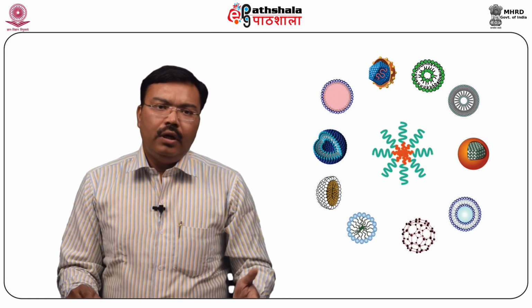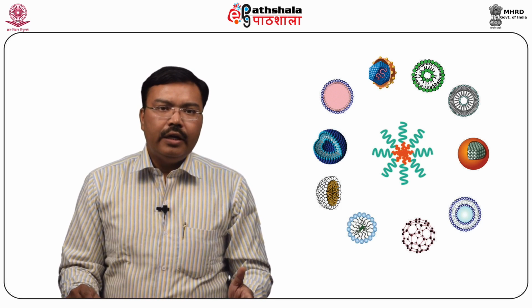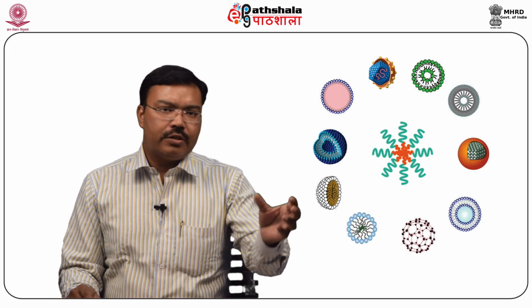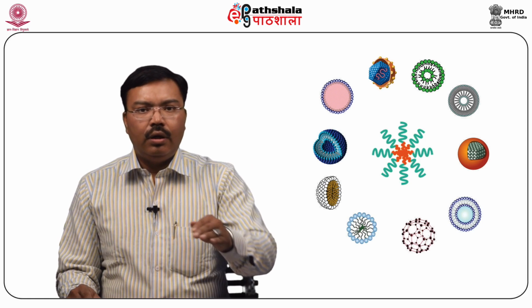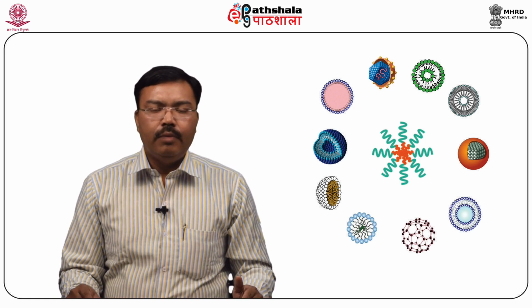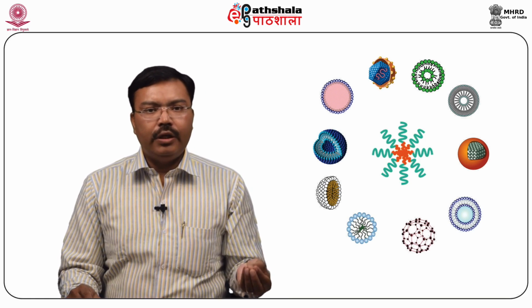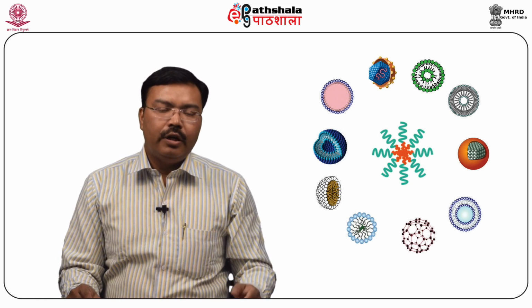In principle, phase contrast microscopy is an optical mechanism to translate minute changes in phase into respective changes in amplitude, which can be visualized as differences in image contrast. For this purpose, we need a specially designed illuminating source of light.